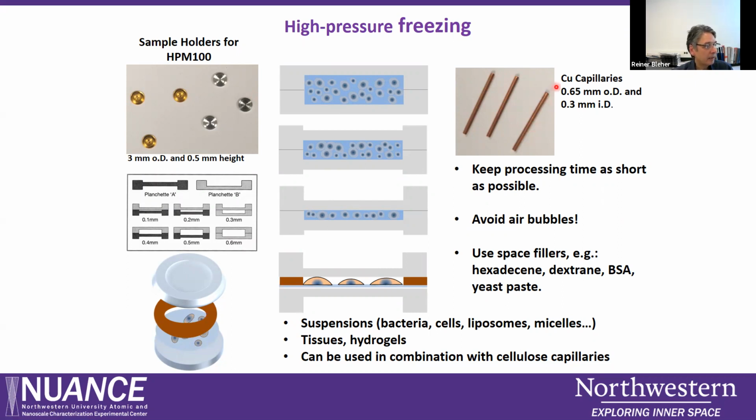Or here we can see the copper capillaries. In any case, it's very important to keep the processing time as short as possible, since we want our sample to be in a very good, healthy condition when we high pressure freeze. And we have to avoid air bubbles at all costs, because air bubbles would be compressed by the pressure and they would delay the buildup of pressure. And our sample would probably show freezing damage if we had bubbles in it.